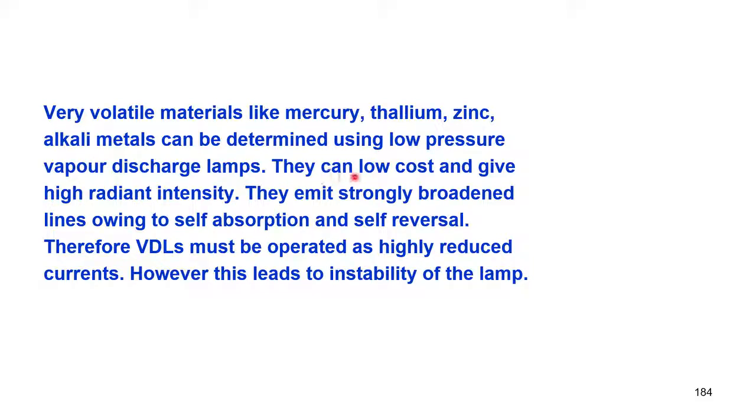They can be of low cost and give high radiant intensity, because these elements are easily converted into vapor phase. They emit strongly broadened lines owing to self absorption and self reversal, because if the vapor concentration is more, there will be a lot of self absorption. This we have already seen in the case of sodium lamps in our street light example.